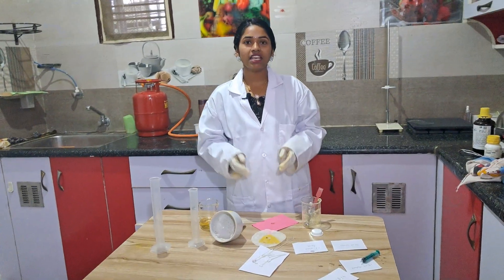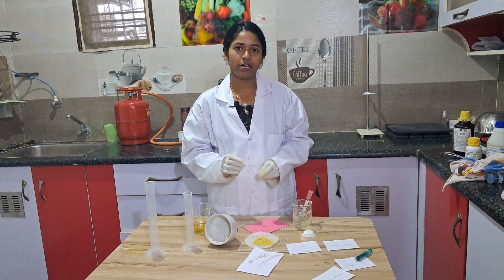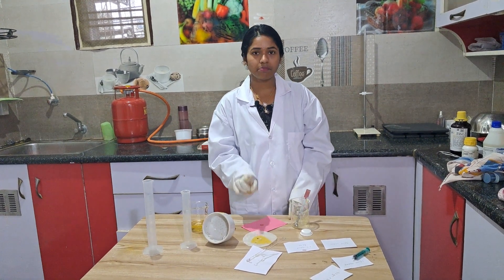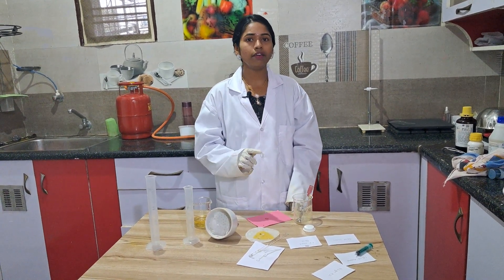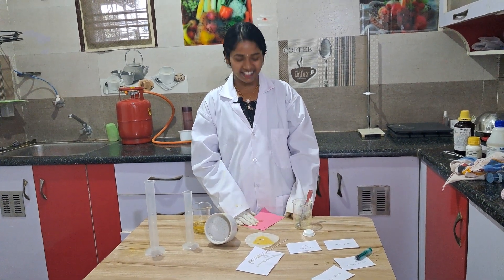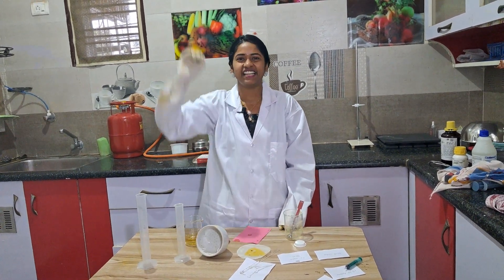Our iodiform is ready. The color of iodiform is yellow — we get an amorphous powder of yellow color. In theory class I will teach you the mechanism behind this: what types of compounds give the iodiform test, what types do not, and what are the exceptions. This is today's practical — see you again with more practicals and experiments. Have a nice day!